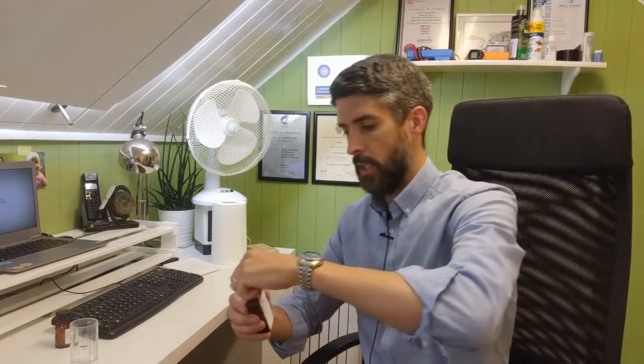Basically, what you're doing is you're getting a 50 ml sample and you're putting in a calcium hardness tablet. Now, these calcium hardness tablets are for the shaker bottle method. So when you're ordering, if you're using the shaker bottle method for testing your calcium hardness, you'll need to make sure that you make it clear to your suppliers when you're ordering tablets that you are using the shaker bottle method, because the tablets that you use for a photometer to test for calcium hardness are completely different.